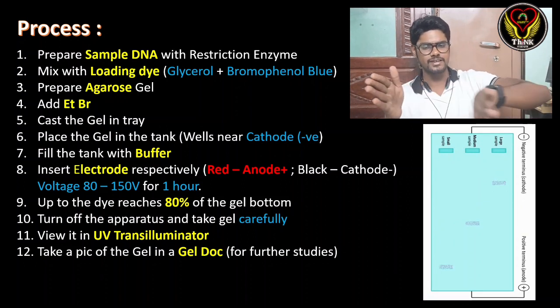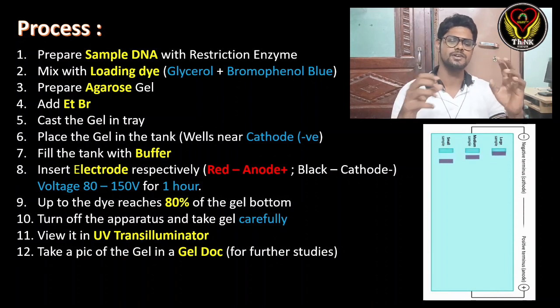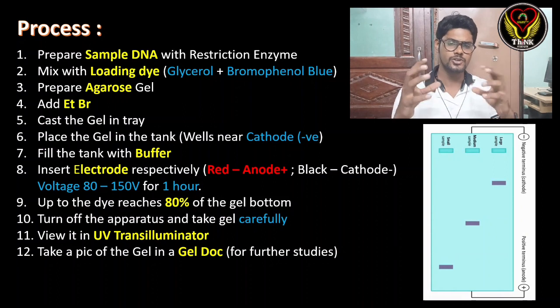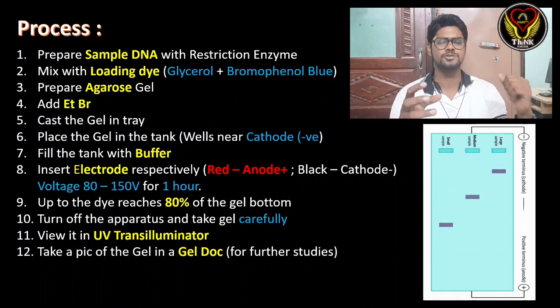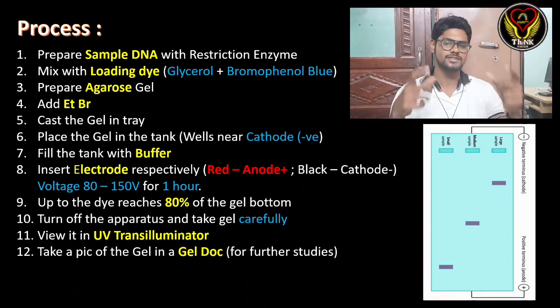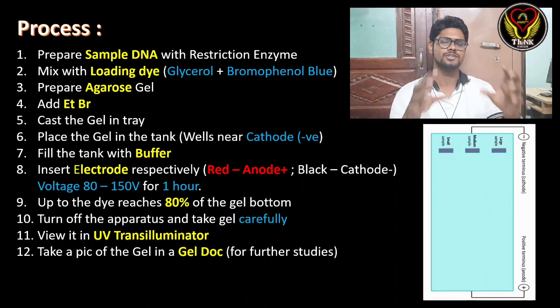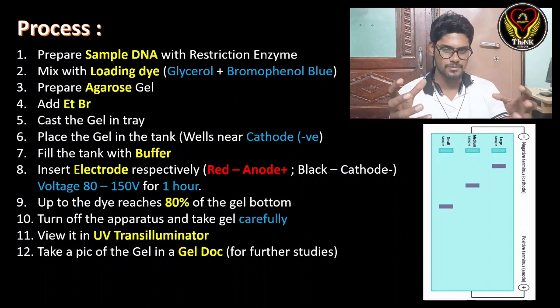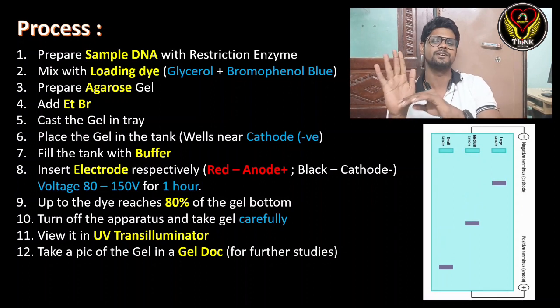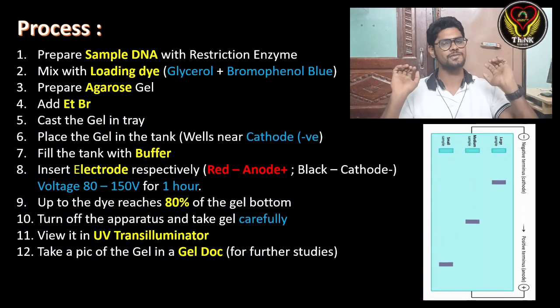When the tracking dye reaches 80% of the bottom of the gel, we have to turn it off and take the apparatus out very carefully. We use it in a UV transilluminator, which helps to visualize the DNA bands, and we can take a picture of this gel and identify where our DNA bands are separated using a gel doc. Based on the principle, the smaller DNA will be separated at the bottom of the gel. This is the basic procedure of agarose gel electrophoresis.